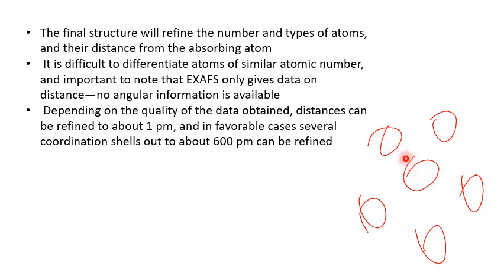Only the internuclear distance is obtained, and there is no information about the angle between the atoms.